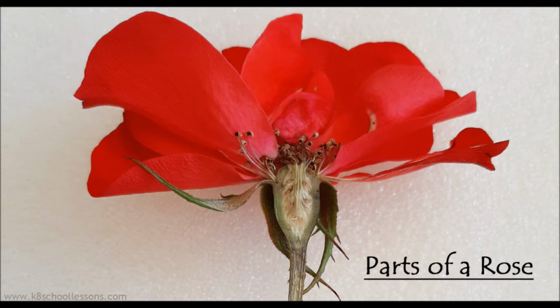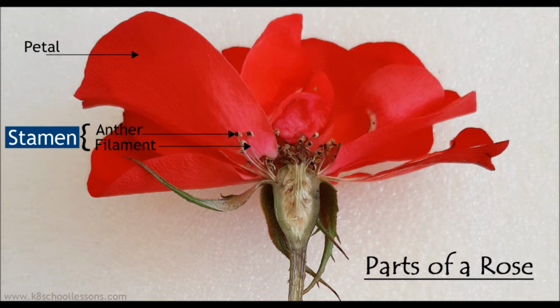Parts of a rose. Petal. Anther. Filament. The anther and filament together are called the stamen. This is the male part of the flower.